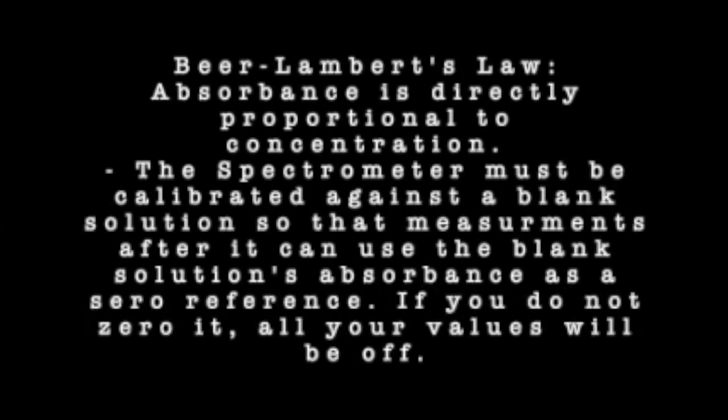Beer-Lambert's law says that absorption is directly proportional to concentration. Another thing that's important is that the spectrometer must be calibrated against a blank solution, or water, so that measurements after it can use the blank solution's absorbance as a zero reference. Knowing all of this, the equation would be A equals ECL, A being absorbance, C concentration, L length of light path, and E molar absorption coefficient.